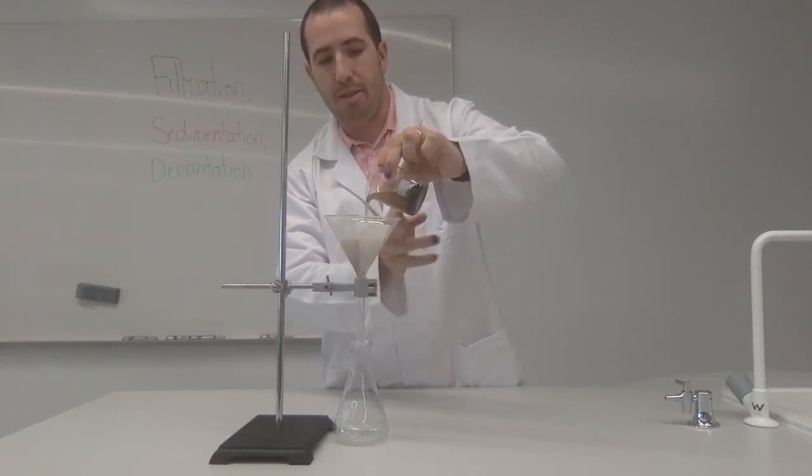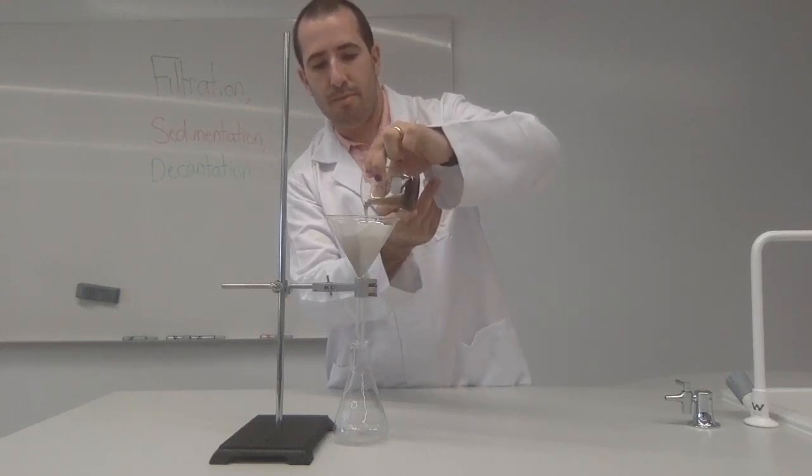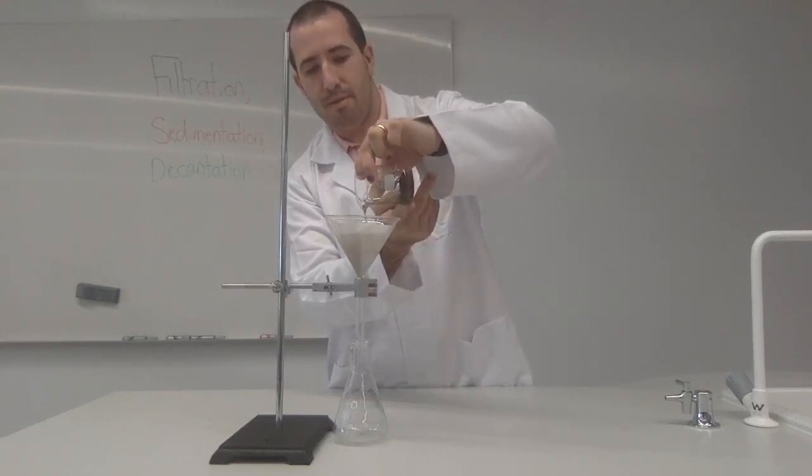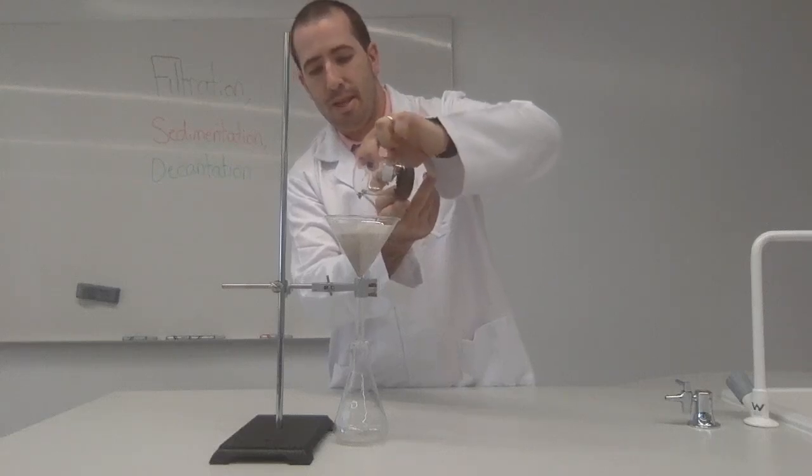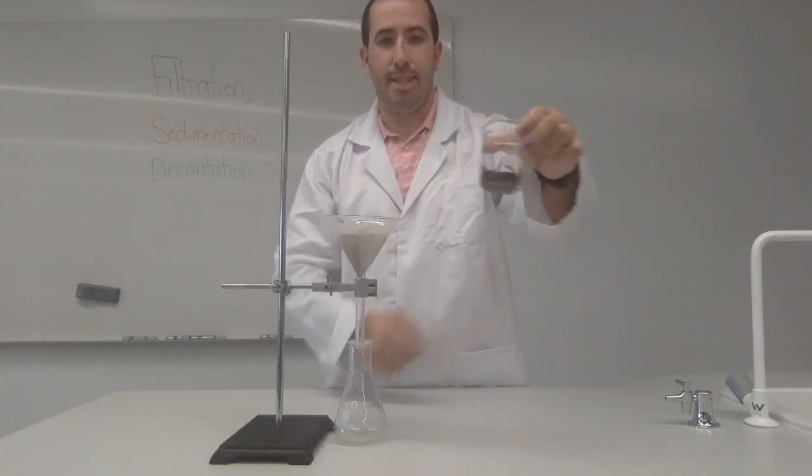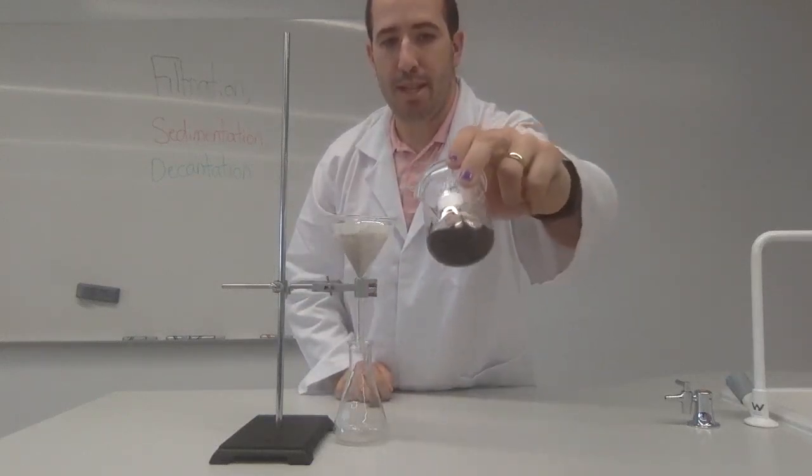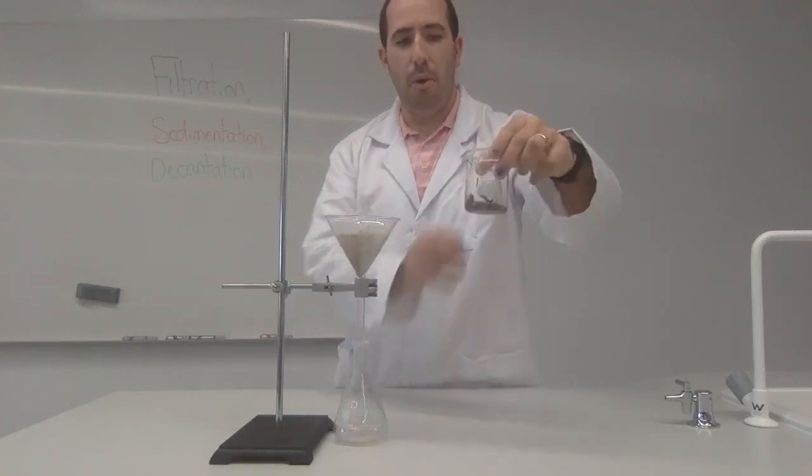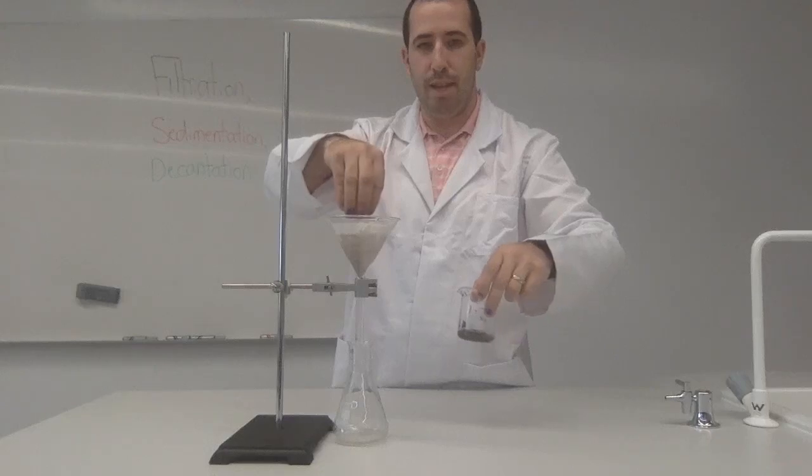So let's do that now. So decanting is very careful. There we go. And so as we decanted, as you can see, back to all the yucky sediments down the bottom and all the rest of the mixture, including all the suspended particles, are into our filter funnel here.